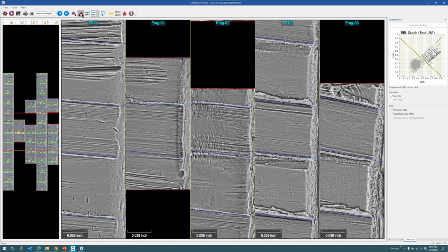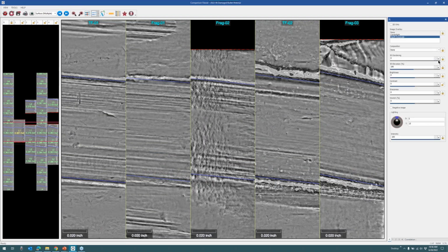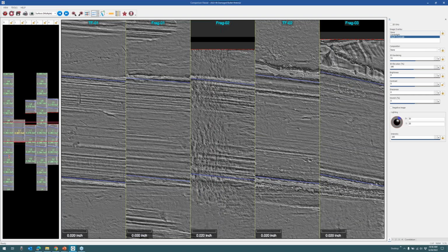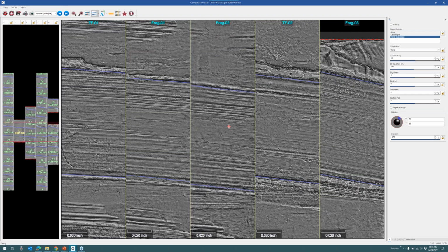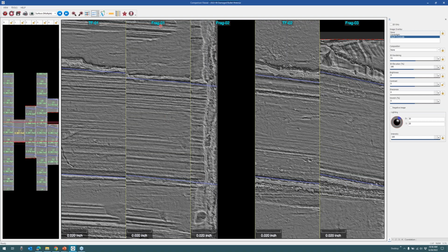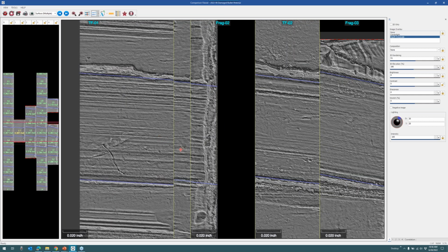So let me zoom into a better view here. One more. And let me add my 3D rendering. Play with the shadows as well. What I can do now, I just remember from previously that land impression 4 matched against 1 and 2 within this set. So I can do a comparison now across testfire 1, fragment 1, and fragment 2, where the machine made me aware of all the agreement that was happening there.